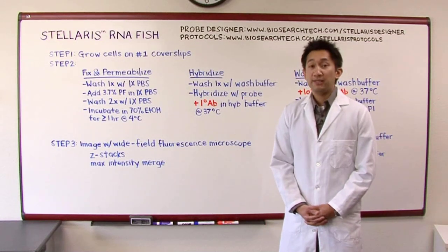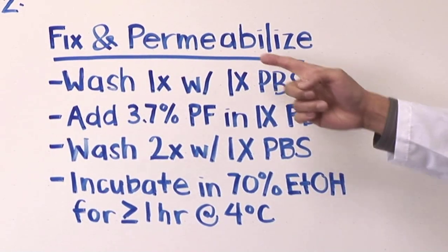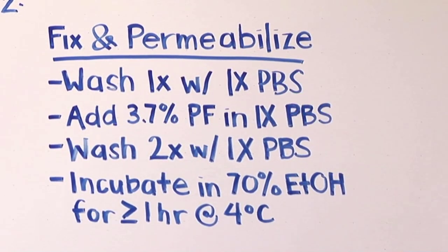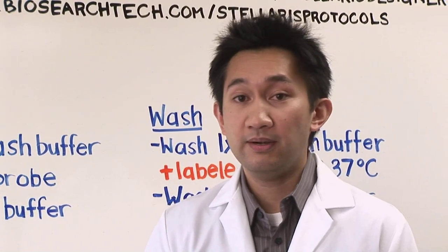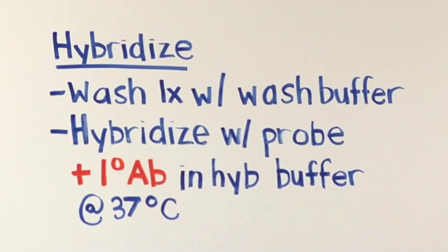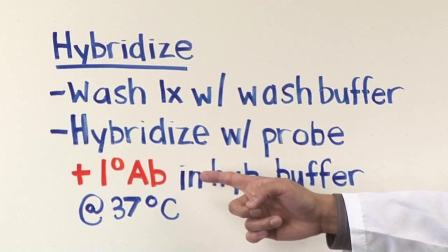So now that my cells have been grown on number one cover slips and are ready to go, the first thing I want to do is to fix and permeabilize my cells. The cells will be fixed in paraformaldehyde and will be permeabilized in 70% ethanol. Now this will allow penetration of the Stellaris FISH probes as well as the primary unlabeled antibody. Secondly is the hybridization step, where we will hybridize the cells with both the Stellaris FISH probes and the primary unlabeled antibody in the same hybridization buffer.